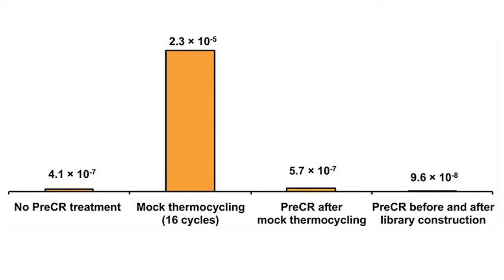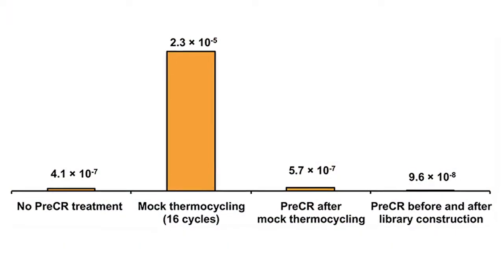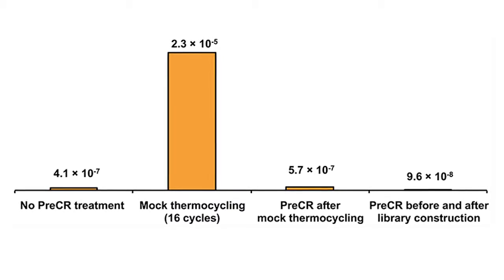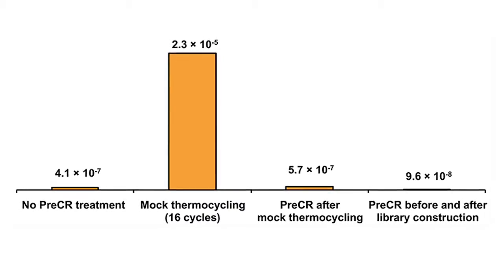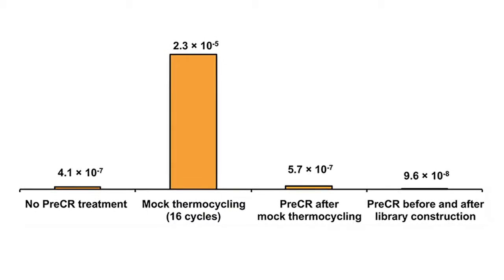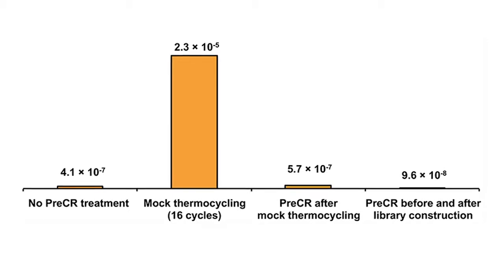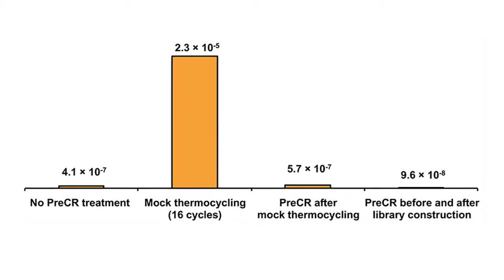Almost all of these mutations were C to T substitutions. We utilized an enzyme repair cocktail called PreCR, which specifically recognizes and repairs DNA damage, to determine that all of these C to T mutations that we observed were actually the result of cytosine deamination that occurs during thermocycling.